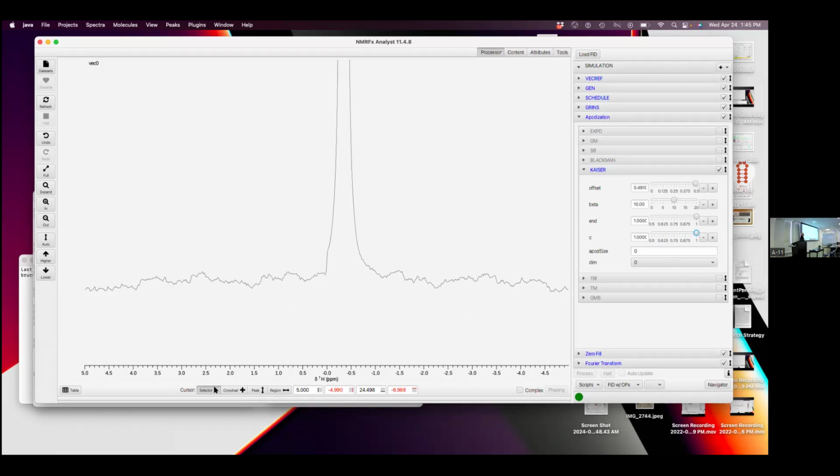If you don't set it to 0.5 in most experiments, then what you find is that the first data point controls the overall integral in the Fourier transform. So basically, it shifts the entire spectrum up and down, and it shifts it in a way proportional to the intensity of the actual peaks. And so you get some peaks going up and down different amounts, and you get these bad streaks through the data, so-called t1 noise. So it's important in those experiments to set C down to 0.5.